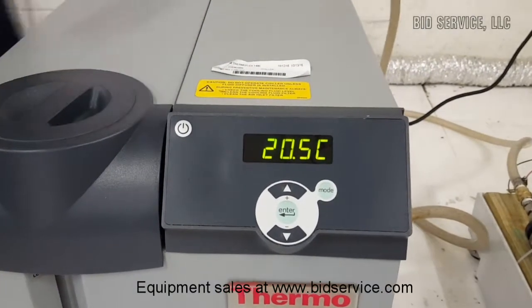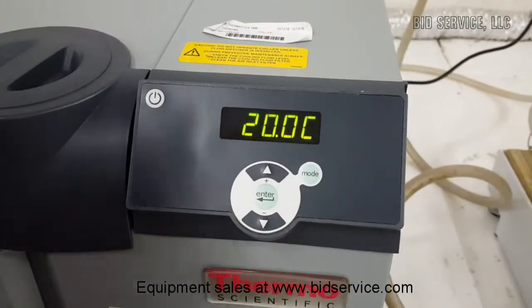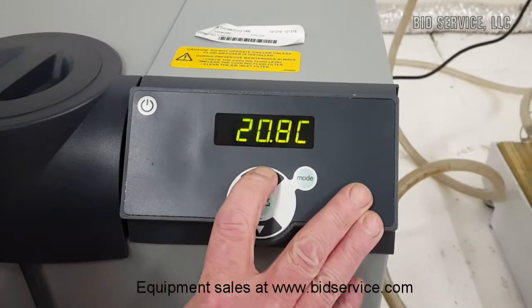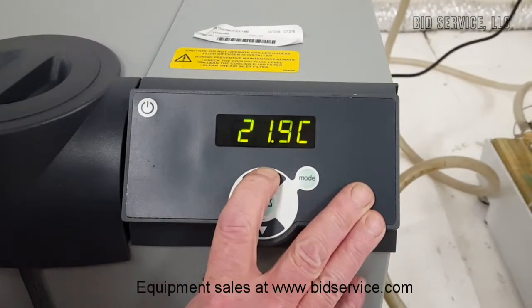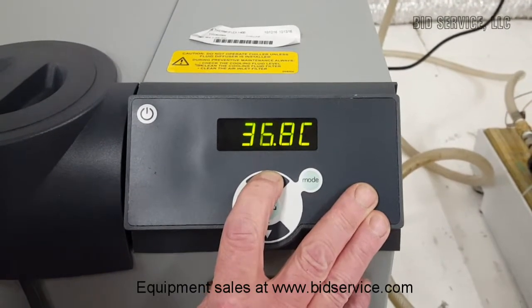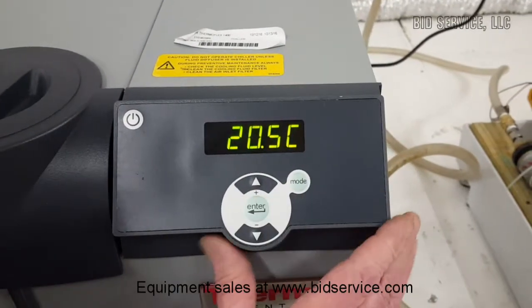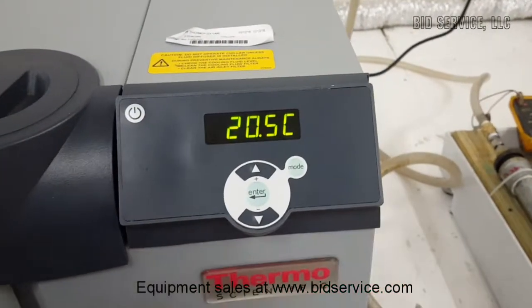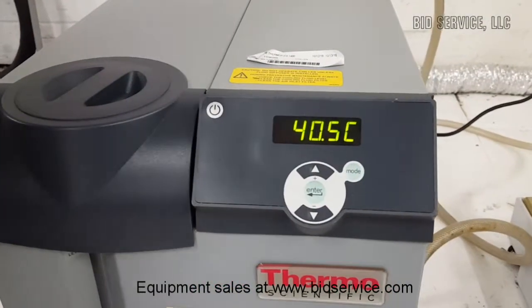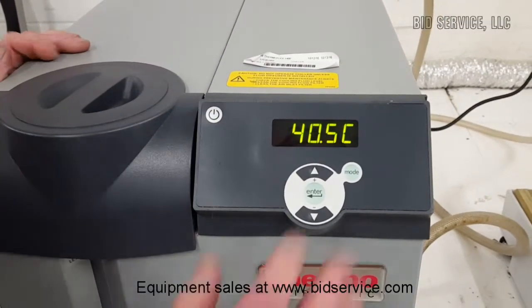The next thing we're going to do is turn off the load and test the temperatures. The high range is plus 40 degrees. We'll enter that and come back in a little bit and see how it's doing. We've reached up to 40 degrees C, a little bit above — this is the high temperature maximum.